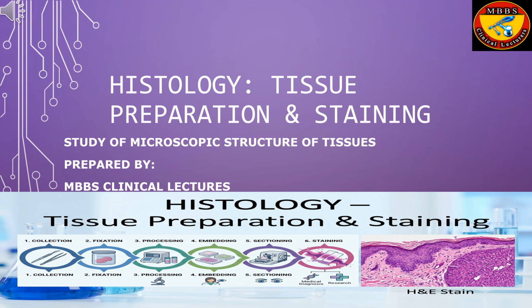Histology plays a vital role in medical diagnosis, pathology, research, and medical education. Through histological examination, doctors can identify diseases such as cancer, infections, and tissue abnormalities. In this presentation, we will learn how tissues are prepared and stained before being examined under a microscope.